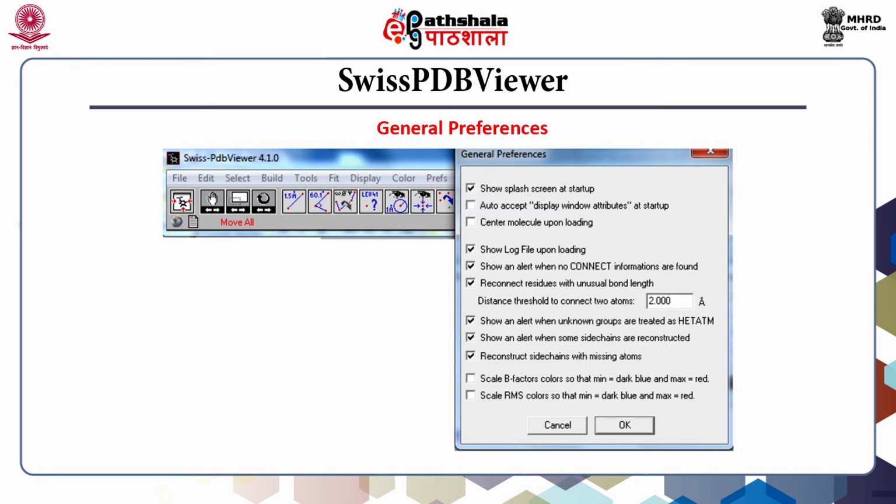Het atoms are the atoms in the structure which are not components of the protein, but they are atoms of an external group such as a substrate, a product, a ligand, metal ion, or a cofactor.